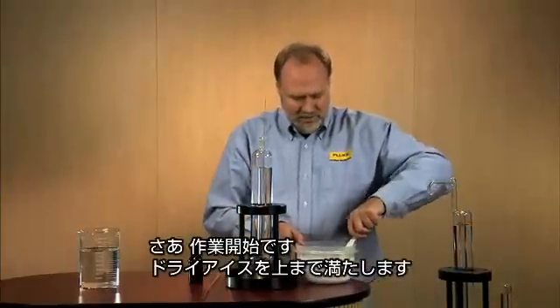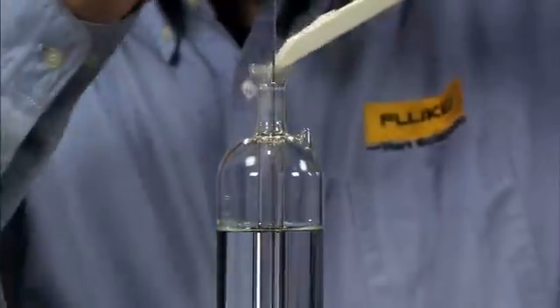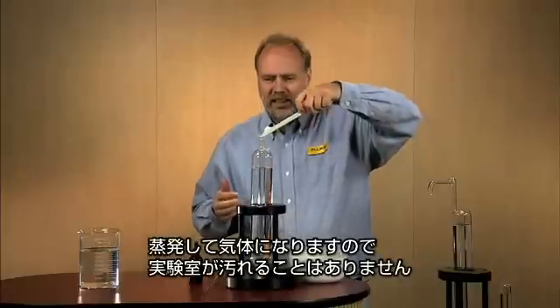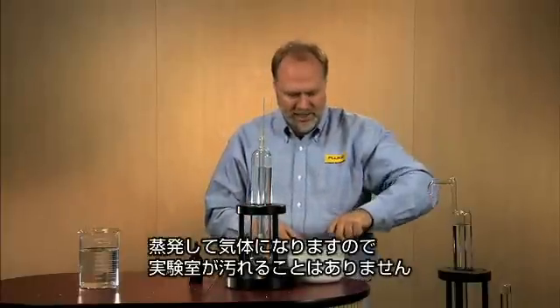Let's get started. Let's try to fill it to the top. Dry ice will spill — that's okay. It evaporates into gas and won't leave a mess in your lab.